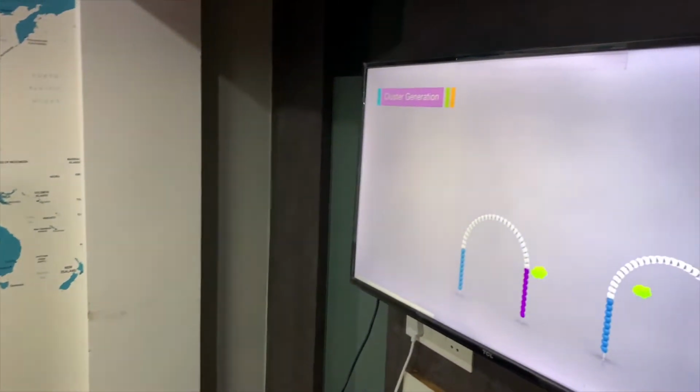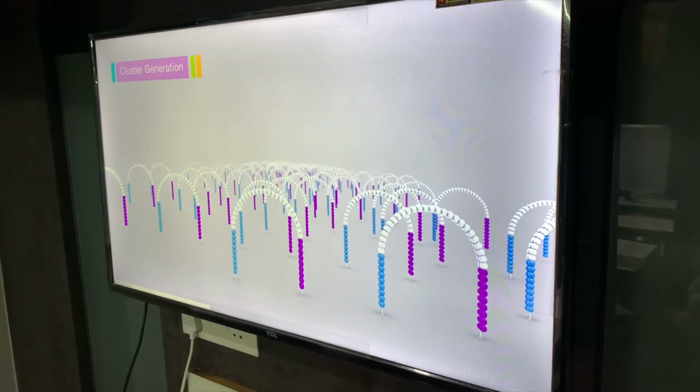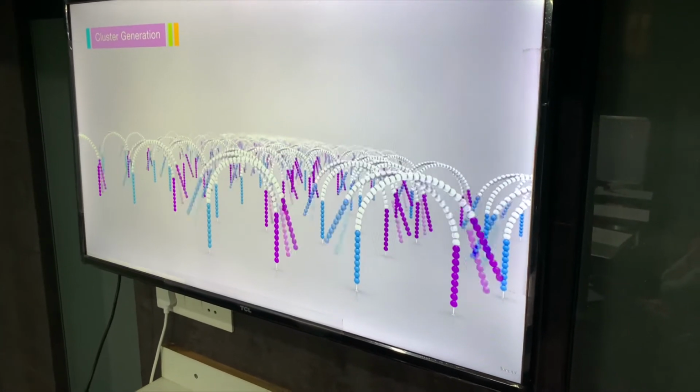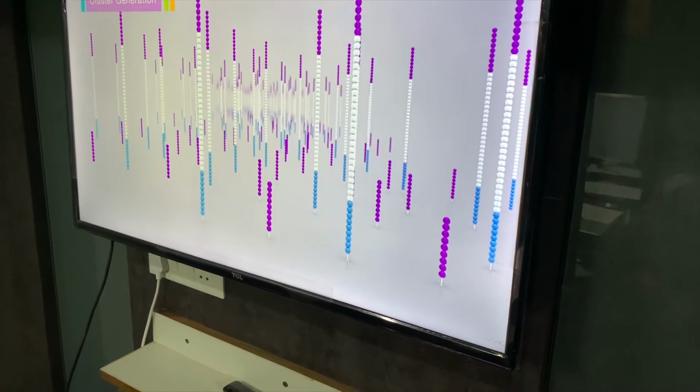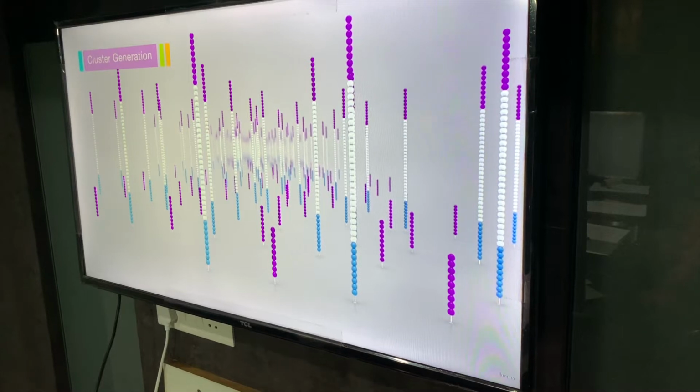The process is then repeated over and over and occurs simultaneously for millions of clusters, resulting in clonal amplification of all the fragments. After bridge amplification, the reverse strands are cleaved, leaving the forward strands. The 3' ends are blocked to prevent unwanted priming.